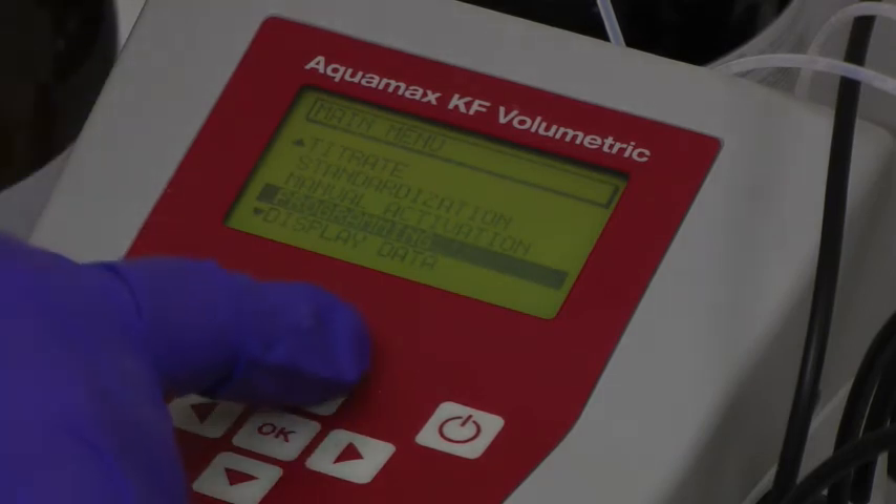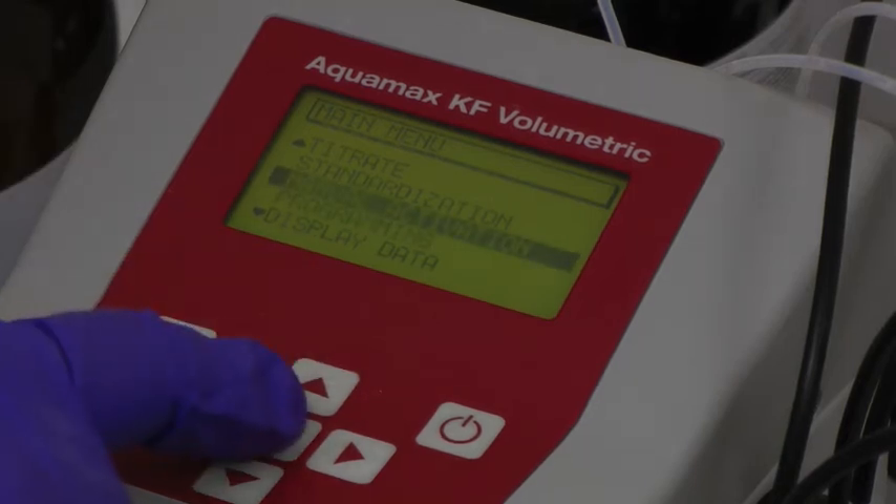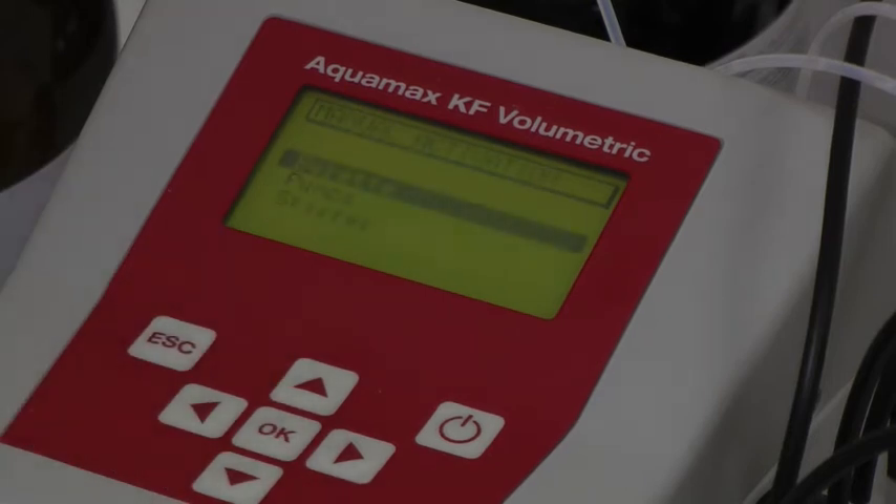Next, manual activation is selected, giving options to purge the burette and pumps, and to activate the stirrer to ensure that it is correctly placed in the sample vessel. Once the system has been programmed and the liquid system and syringes have been primed, the standard is ready to be run.